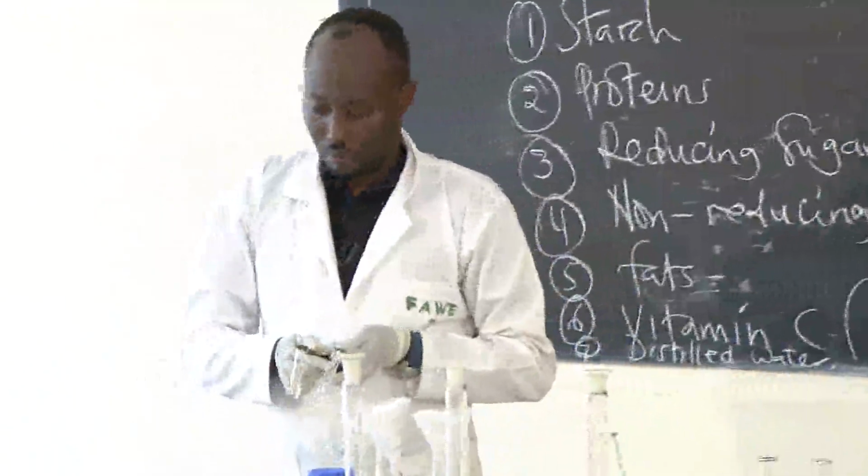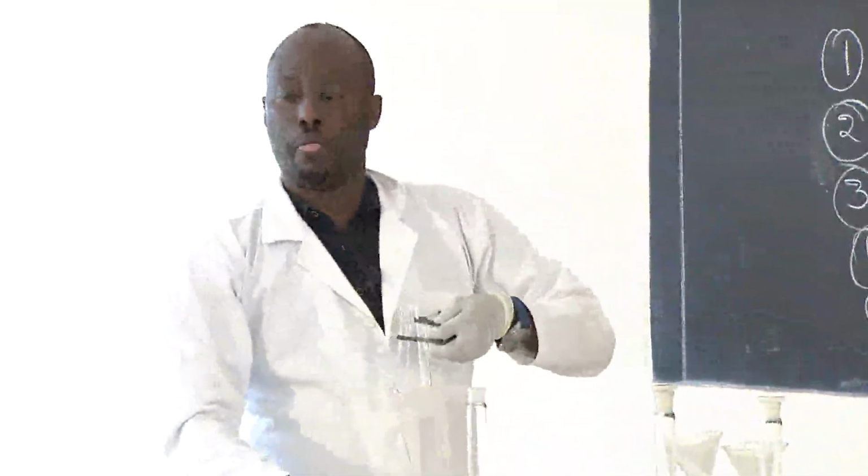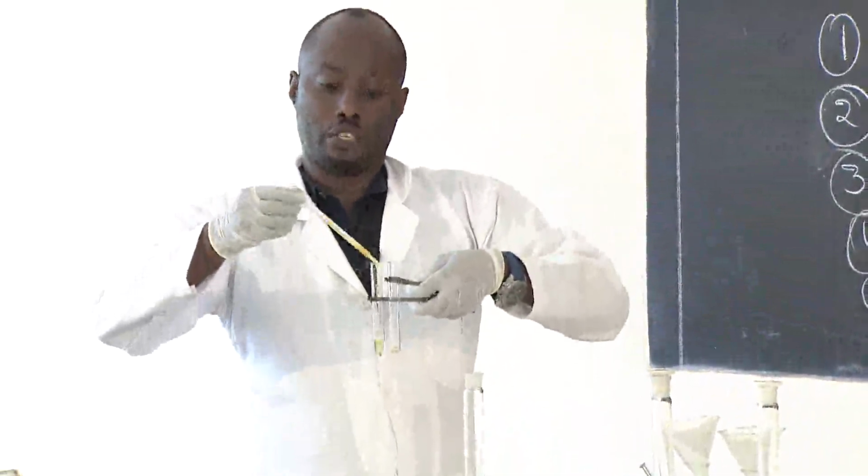I'm going to put the same amount of iodine solution now in the two test tubes. I add the same drops.